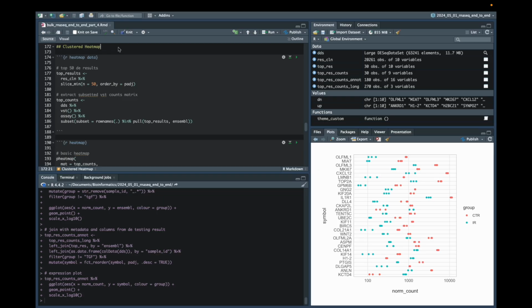Now, although ggplot2, which regular readers of my blog will know I absolutely love, has a geom_tile function to make heat maps, specialized packages such as the pheatmap package offer more functionality such as scaling values and clustering the data, and it's all about picking the right tool for the job. So while ggplot2 with its extensions are great for hundreds of plots in R, the dedicated packages out there for making heat maps and related plots like oncoprints are just better for those tasks.